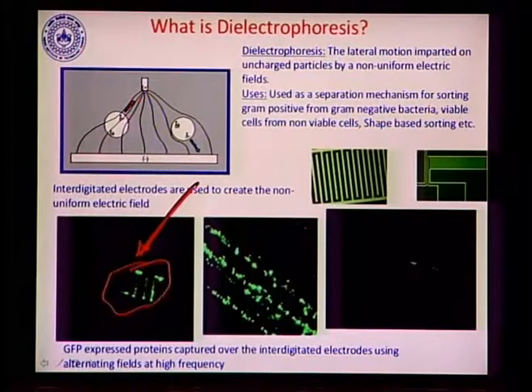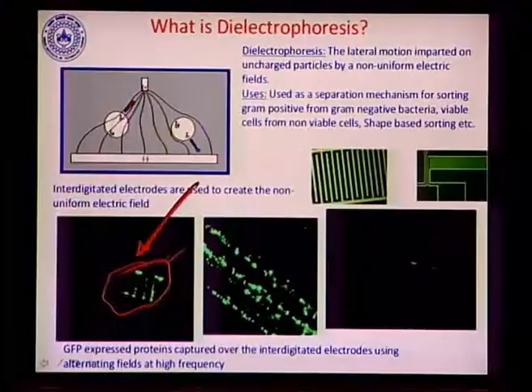This is green fluorescent protein expressing E. coli, this is O157:H7, a highly virulent bacterial strain, and you can see that in that small 1 picoliter size chamber, the cells are aligning with the electrodes, and it is sitting more towards the top of the electrodes, which means that it is now going into the lower field zone, and it is the inverse DEP which is happening, which means that the particle's dielectric constant is probably lower than the medium's dielectric constant.